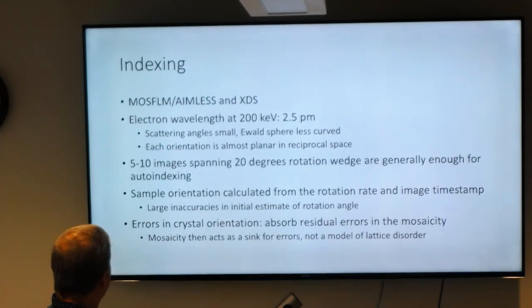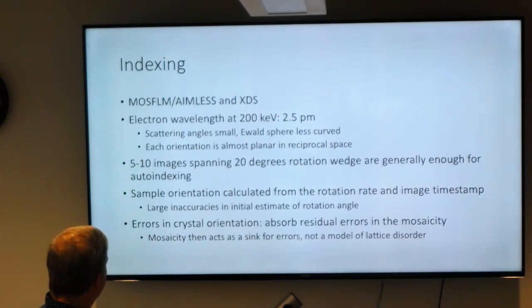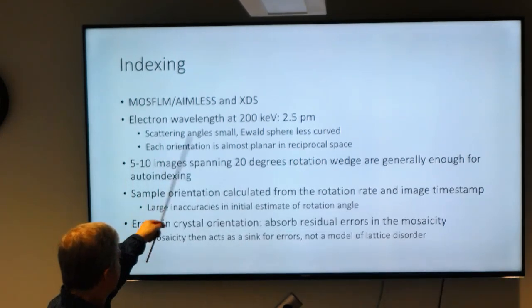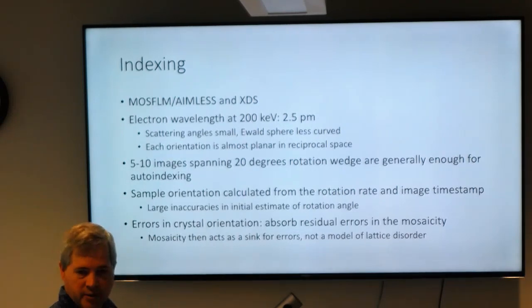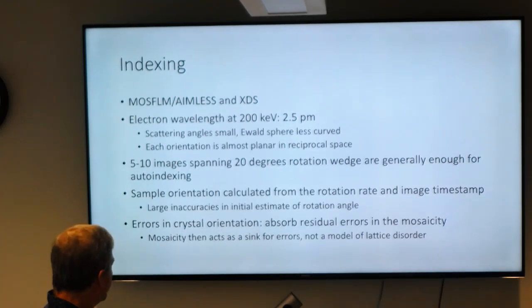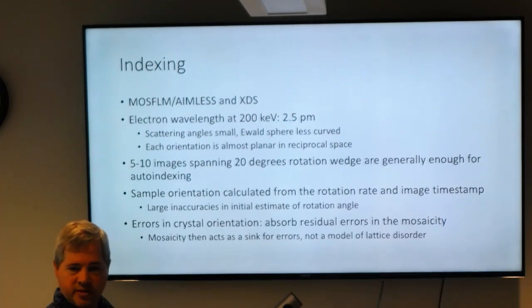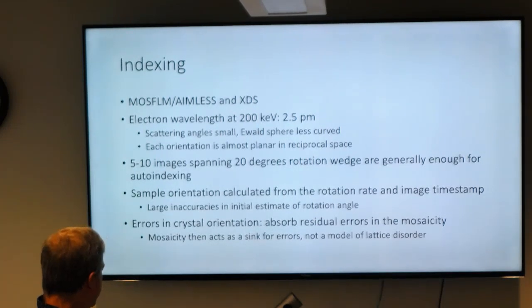So, the indexing. Tamir Gonen gave a course. He gives a course almost every year, and I went to it at Janelia almost 4 years ago. He was using MOSFLM at the time, and that seemed to work pretty well. We collected at 200 kV, the auto-indexing worked pretty well, and we were able to do lysozyme without too much trouble. It was a 3 or 4 day long course, but I would recommend that if you want to do it, you look up when he's giving his course next. He's now at UCLA, but he gave a very good course on how to actually do this.